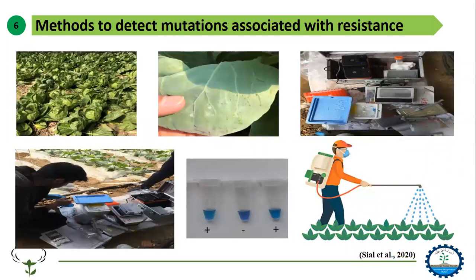Here are some pictures of my research, which I did during my studies. Some applications in the field, some applications in the greenhouse. You can see some portable equipment was employed in the field. After 1 to 2 hours, we could see the result just using our eyes. I mean, no need for electrophoresis analysis, no need for particular lab equipment or sophisticated environment. So here are the positive and the negative symbols.